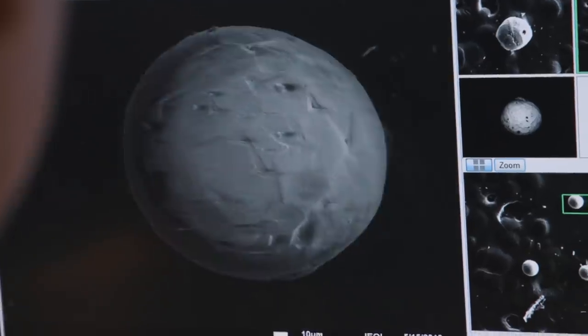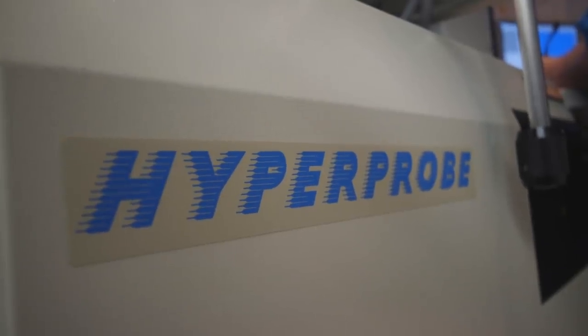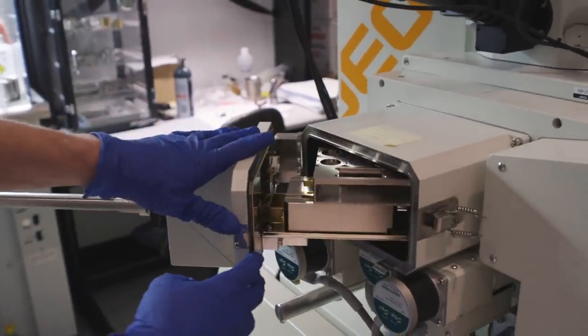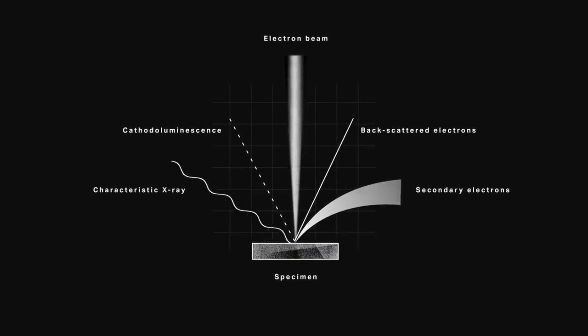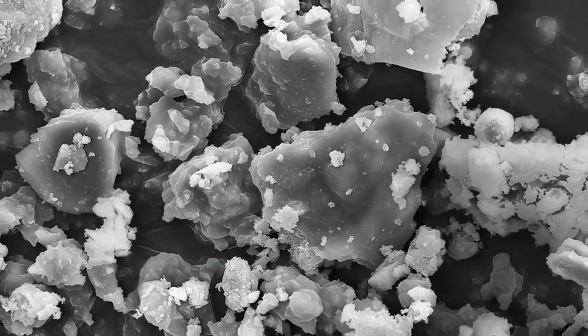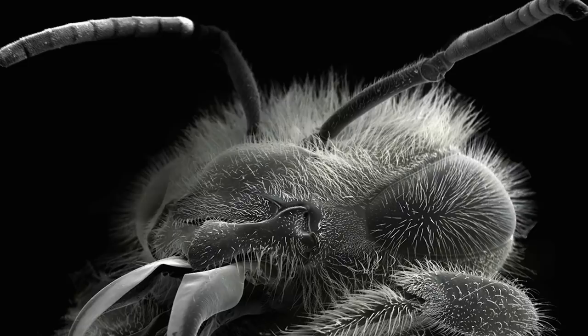Mike Zielinski is a space scientist at Johnson. He's walking us through the electron microprobe. It uses a stream of electrons the way a microscope uses photons. Particles bounce off your sample and hit a sensor, returning a wonderfully detailed image of tiny rocks or anything else you put in there.